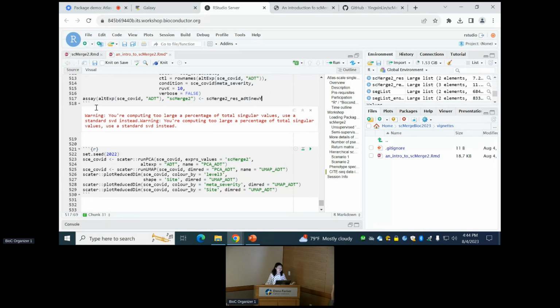I have a curiosity question while people are thinking of questions. You have stably expressed genes. For human, it looks like these are ribosomal proteins, spliceosome, DNA replication. I notice you don't have histone proteins. Do you know why they do not show up in your list?